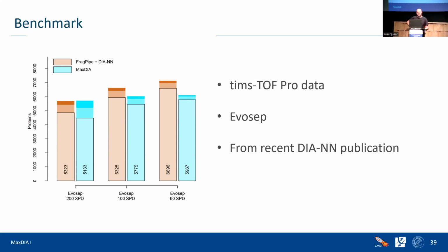Hello, thank you. Is it possible, when using an in silico library, to not specify any enzyme, like not any trypsin, and do an unspecific search? This might be a bit too much, because then you generate a very big library. It relates to the previous question: the running time scales linearly, and probably in this case a bigger problem is the memory usage, which also scales linearly. So for unspecific cleavage, HLA peptides, proteogenomics, DDA is the way to go. Thank you very much.